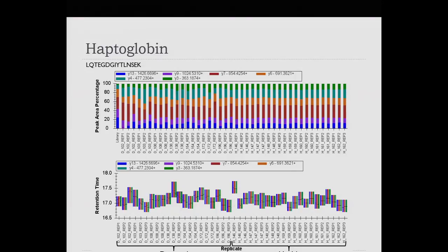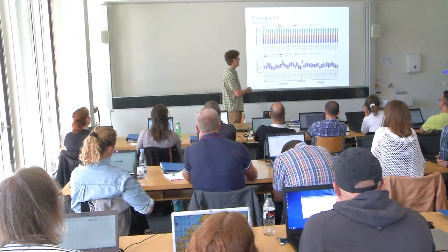That's not the way they were measured necessarily. It's just a logical ordering, and the variance over here is much greater than the variance over here. And so I'm about to, next slide, denormalize this data. What do you think you're going to see based on that?